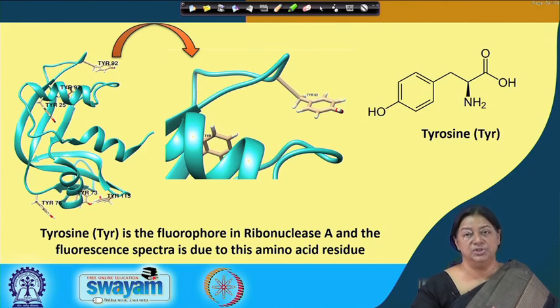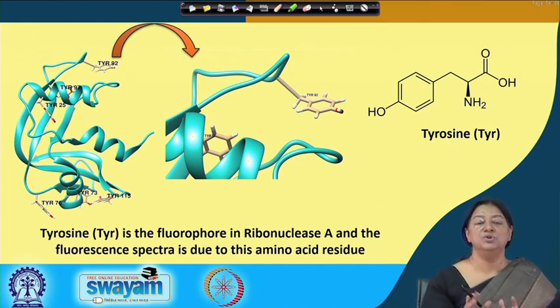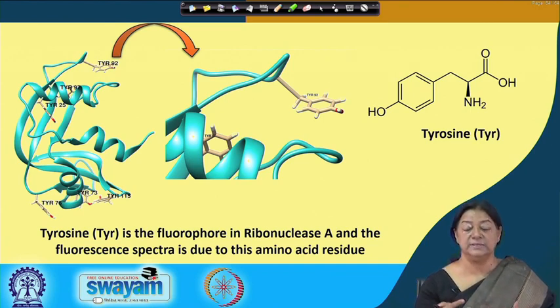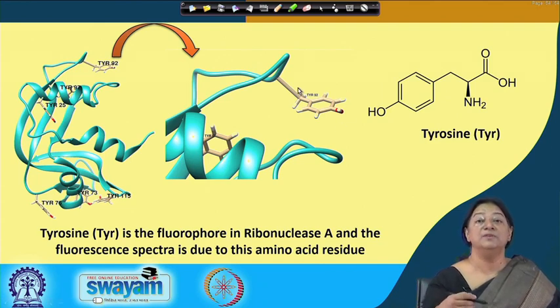So, any changes in the structure of the protein; we will look at the structure of proteins in more detail in further lectures. If this protein gradually unfolds, the tyrosine is going to get more exposed, and there is going to be greater fluorescence intensity. And so, this is where our amino acid tyrosine is going to show up in the fluorescence intensity spectrum.